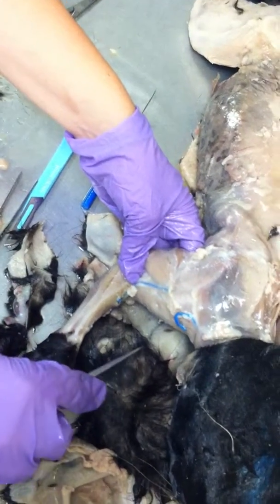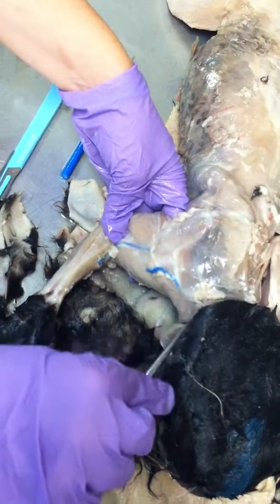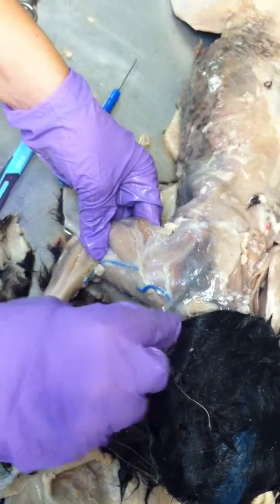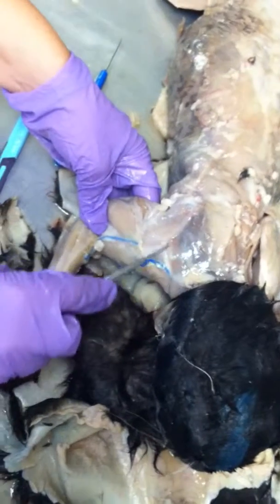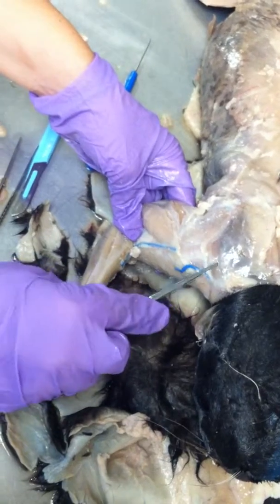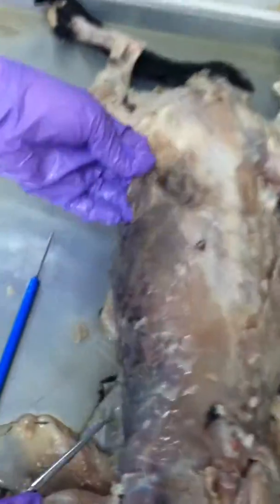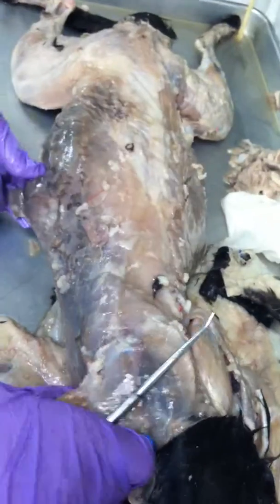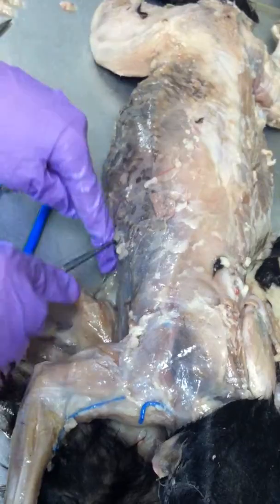All your deltoid muscles point to the trapezius muscles. So here's clavodeltoid. Up here is clavotrapezius. Acromiodeltoid right here would be acromiotrapezius. Spinodeltoid points to spinotrapezius right here. This little guy that we failed to mention was levator scapulae ventralis. In humans, it's just levator scapulae, and this helps to lift or shrug your shoulders. This pocket muscle right here, which I can't get to. Oh. This muscle right here, this big muscle, is the latissimus dorsi.